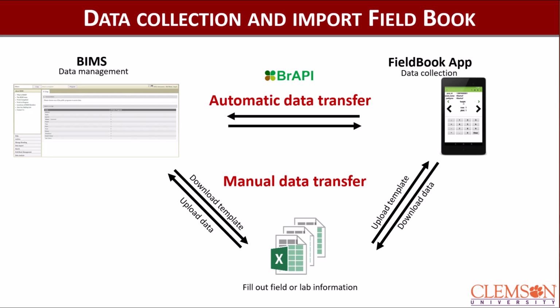In a nutshell, this is how it works in my program. We collect the data in the lab or in the field with the Fieldbook. We automatically transfer the Fieldbook data through BrAPI.